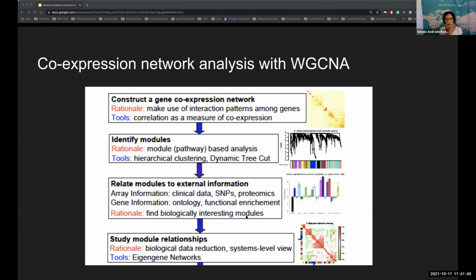It does it with some parameters that you will give, like the genes having to have a certain threshold of expression, and having to be connected, or overexpressed in certain samples. You can play a little bit with this tool to get to this more reduced type of graph, and be able to actually interpret your data.